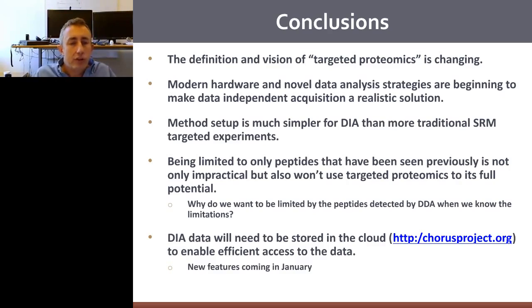I do think that the future of proteomics will require that our data will need to be stored in the cloud and accessed remotely, and those features are coming in January.